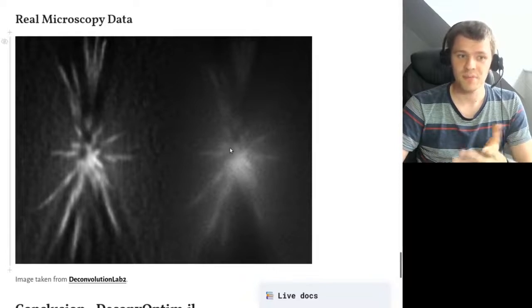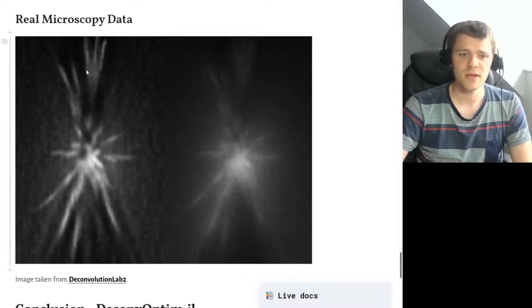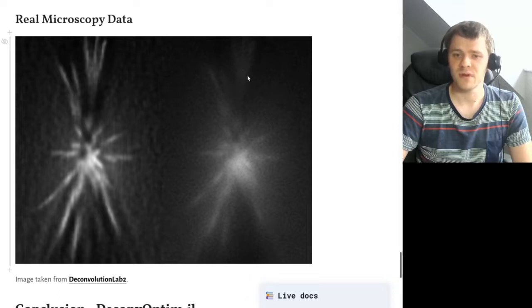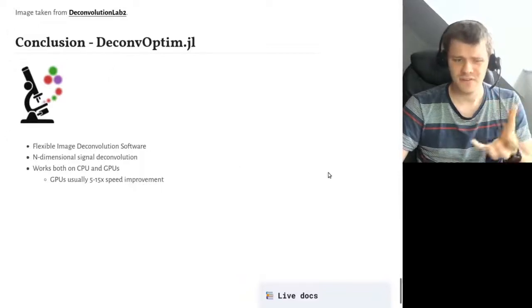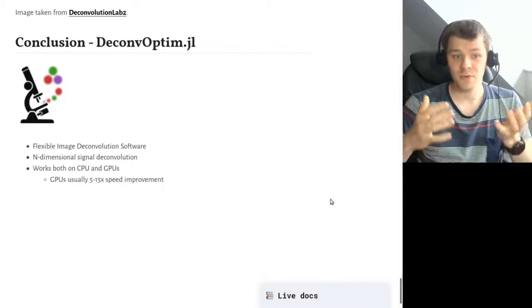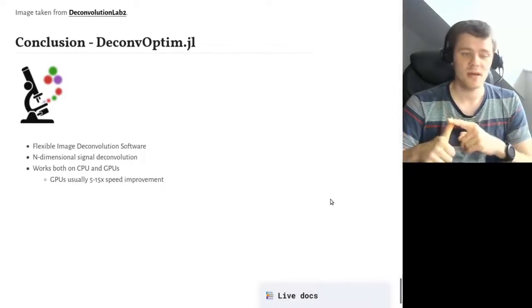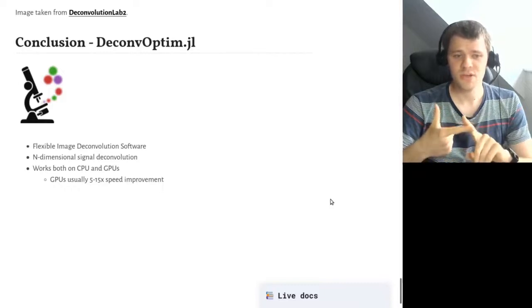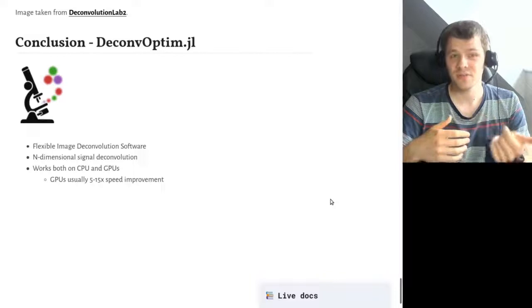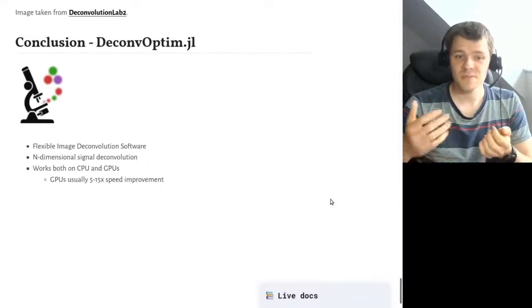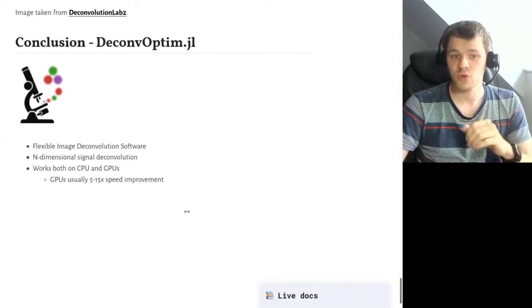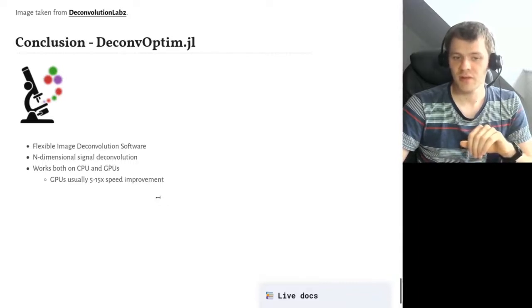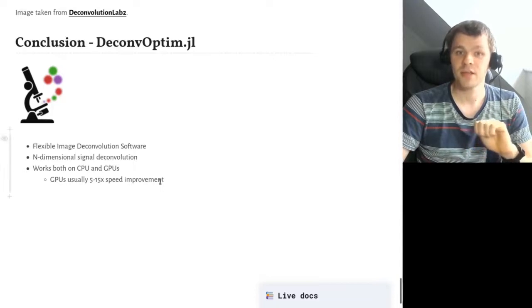We can also look at real microscopy data. On the right hand side you see a very blurry and noisy image, and on the left hand side you can see the deconvolved one — for example you can now see three fingers and two fingers that were barely visible in the original. In conclusion, DeconvOptimJL is a very flexible image deconvolution software. It works with N-dimensional data: 1D, 2D images, 3D volumes, and even 4D or 5D images for different color channels or time series. It works on both CPUs and GPUs, and on a GPU we typically see a speed improvement of a factor of 5 to 15 depending on the hardware.